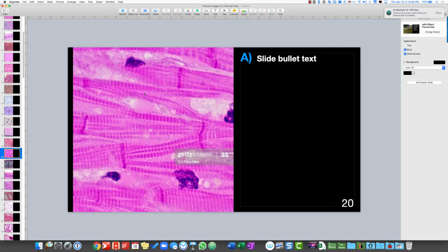Characteristics of cardiac muscle include, well, they have striation just like skeletal muscle, but they also have this branched pattern which skeletal muscles don't have. Additionally, they have these intercalated discs. Finally, they generally have only 1 to 2 nuclei per cell. Here, you don't see the nucleus for some of the cells because those nuclei have been cut out of the plane. They're out of the plane. That's why they appear to be gone.